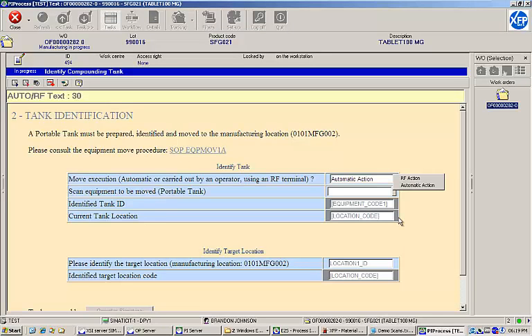Now that the procedure has been reviewed, I am prompted to choose between moving the identified tank using a radio frequency device or having it moved automatically. At this point, I want to take a look at the EBR workflow view to demonstrate the significance of this choice.